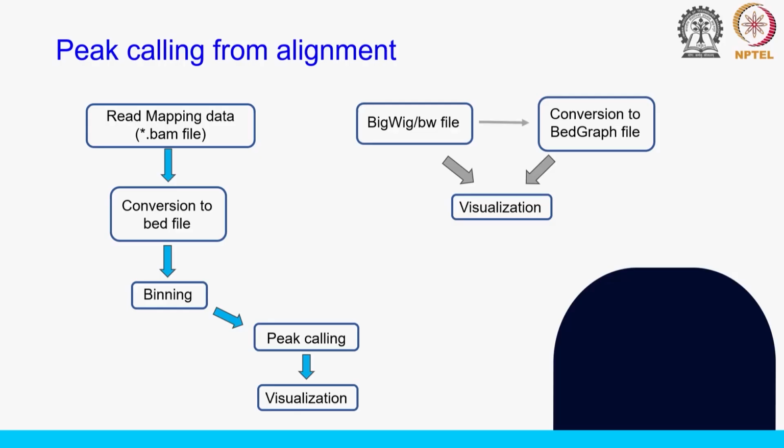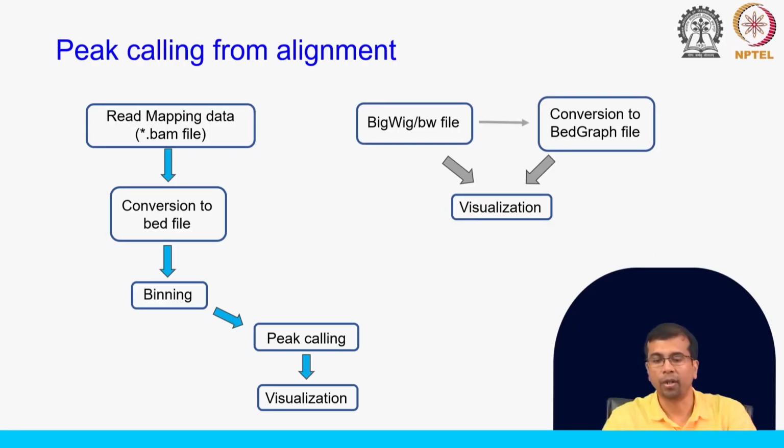Okay, so, we have seen this flowchart already. So, we have talked about the left part. And then what we are going to talk about now are the right part, right, where we start with a BW file and we actually visualize the results.